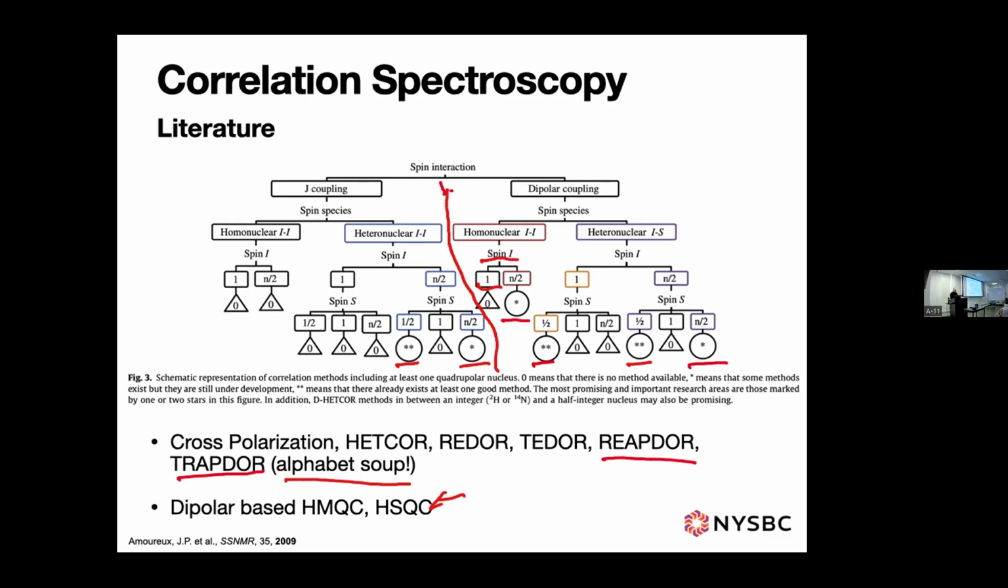And part of that is just, you have to be motivated and you have to have the right nuclear combination in your sample to need that experiment. Unlike our general thinking, labeling is not big outside of biomolecular NMR. So most people don't label their samples. They try to find a nucleus that has a good enough natural abundance that they can just take the spectra on it. It can be fairly expensive or just prohibitively difficult to try to label.